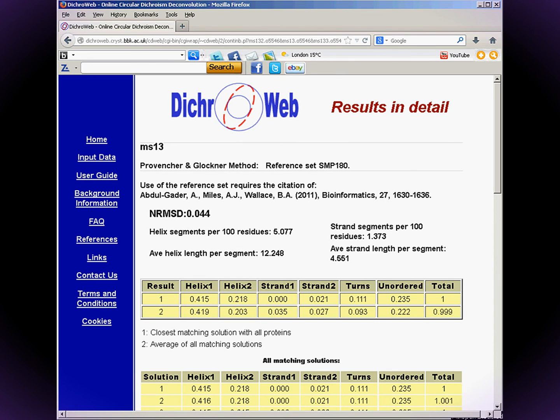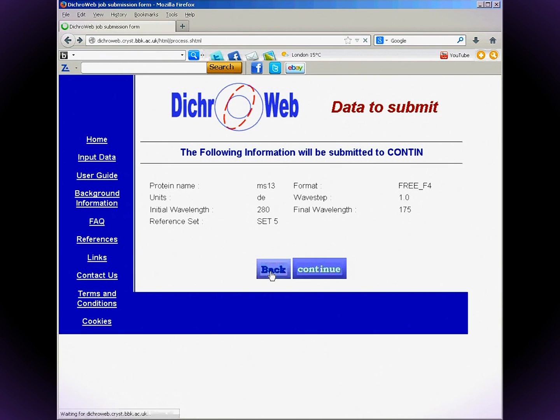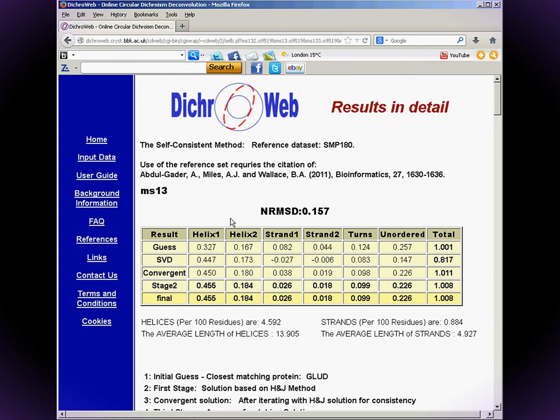In the results table, the total alpha-helical content is the sum of helix one and helix two, and the total beta-sheet content is strand one and strand two. Go back to the input page and use the SELCON analysis program — you'll find that the NRMSD is usually higher than with CONTIN.